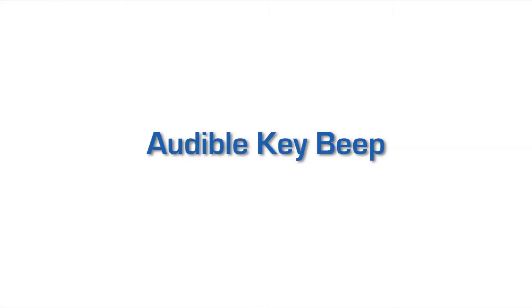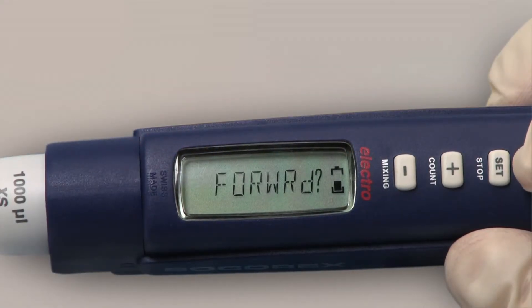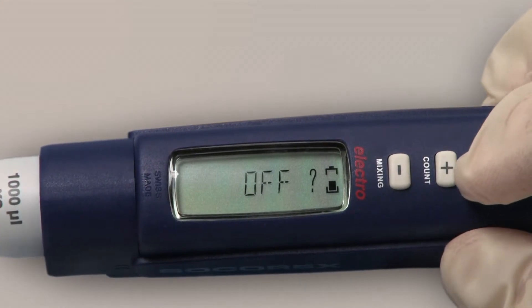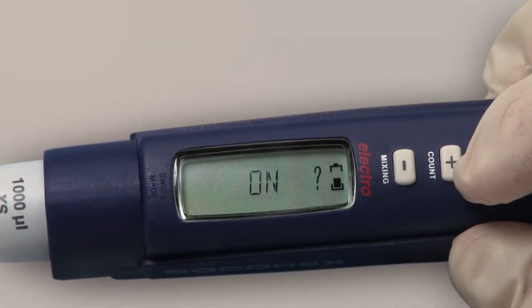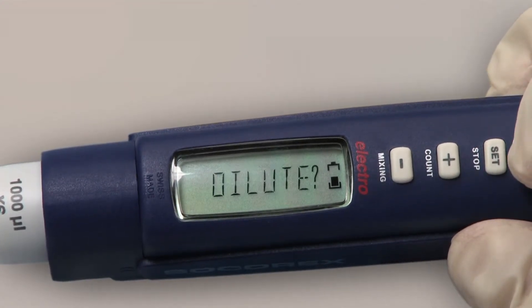The beep sound on the keys can be turned on or off at any time. Press mode for two seconds and press mode again until beep shows. Confirm by pressing set. Use the plus/minus keys to change on or off. Press set to confirm your choice, then press mode again for two seconds to return to the pipetting menu.